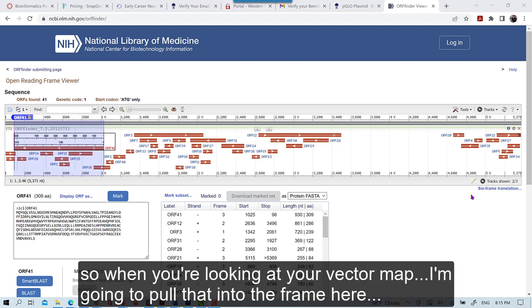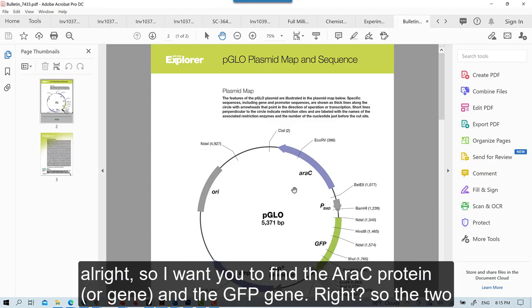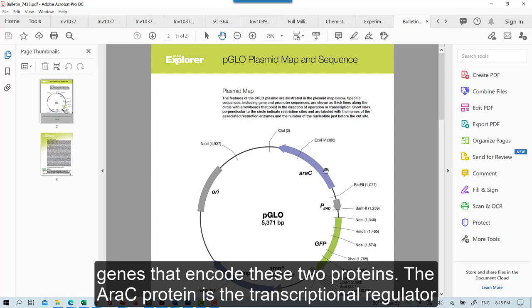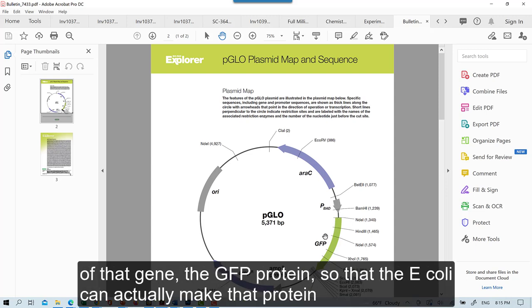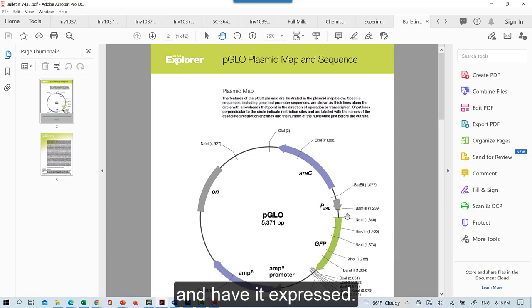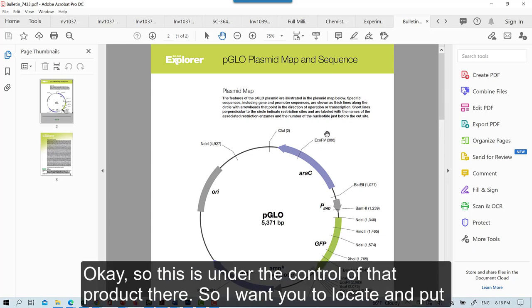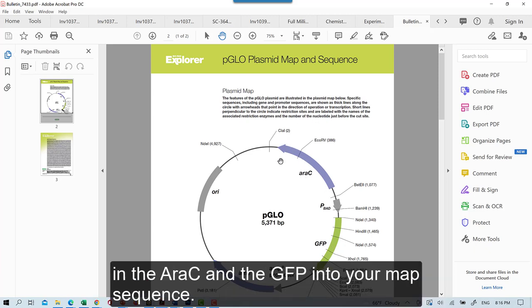So when you're looking at your vector map, I'm going to pull that into the frame here for a second. Alright, so I want you to find the AraC protein, or gene, and the GFP gene, right? So the two genes that encode these two proteins. The AraC protein is the transcriptional regulator that's controlled by arabinose. And it will bind to this promoter, and it will allow the transcription of that gene, the GFP protein, so that the E. coli can actually make that protein and have it expressed.